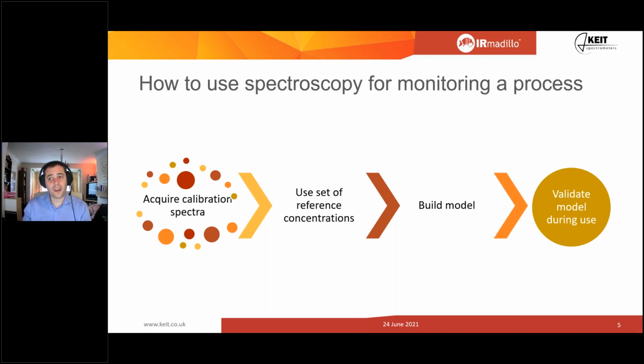So something like an HPLC measurement, a titration, if you're looking at things like free fatty acids. If you want to do phosphorus levels, you might put them through an atomic emission spectrometer. If you've got an NMR machine, you might use that, although they are really expensive. But that kind of offline analysis to get that data. Then you build a model.